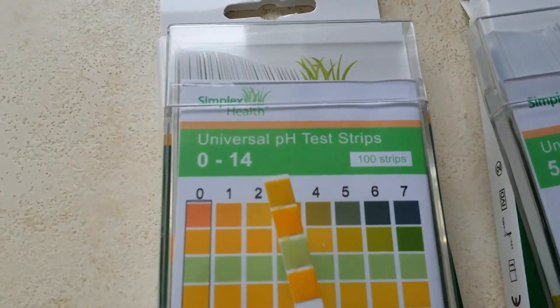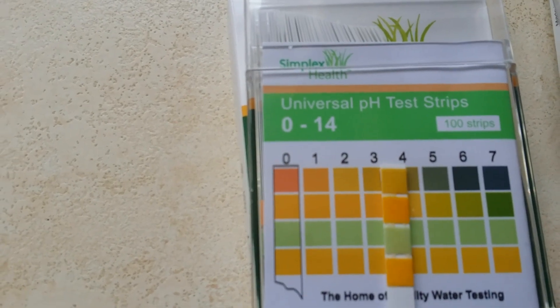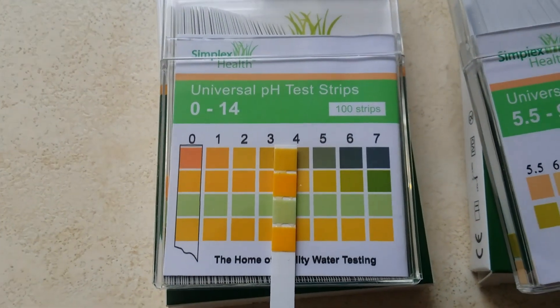As you can see, the strips change color straight away. Match it against the chart and from there you can straight away see that it has a pH of 3.